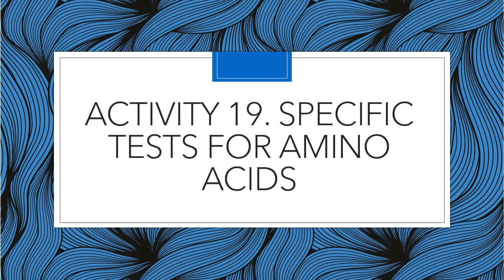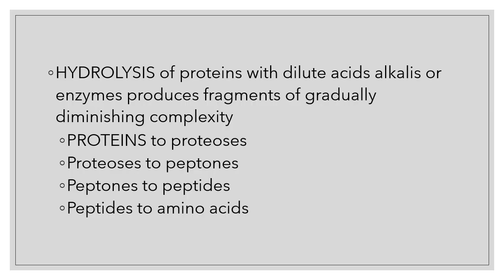When you join amino acid plus amino acid, and then another amino acid, and more and more amino acids together, you will make a protein. And so that is for your amino acids. Let's take a look at the hydrolysis of your proteins first.